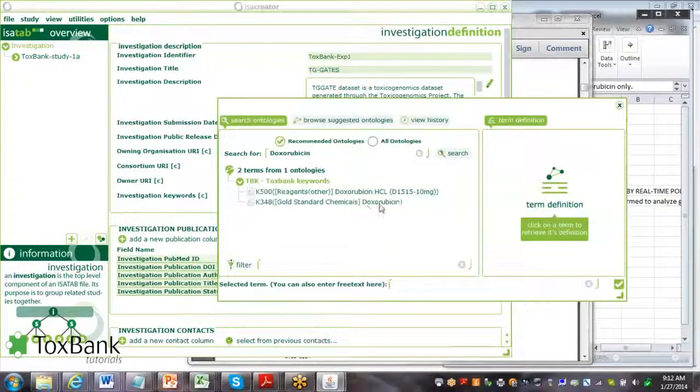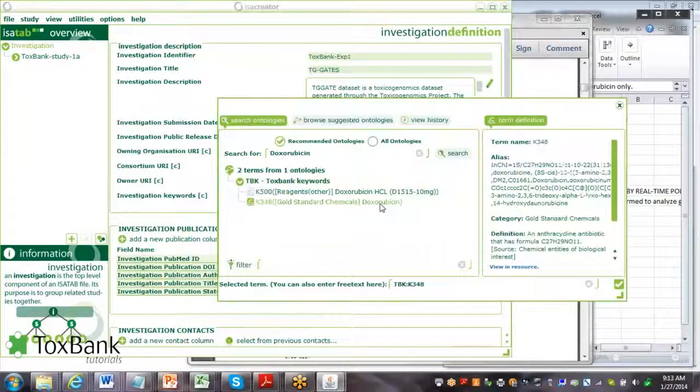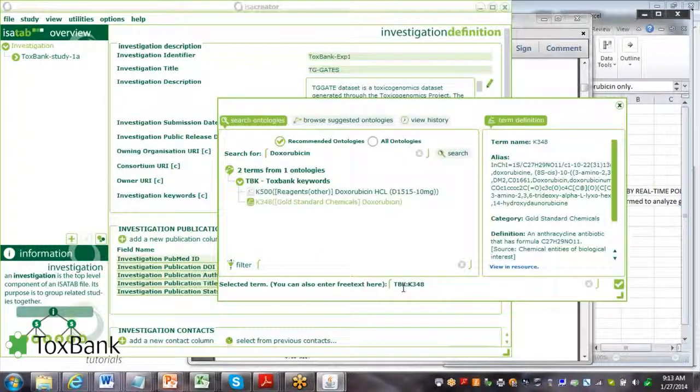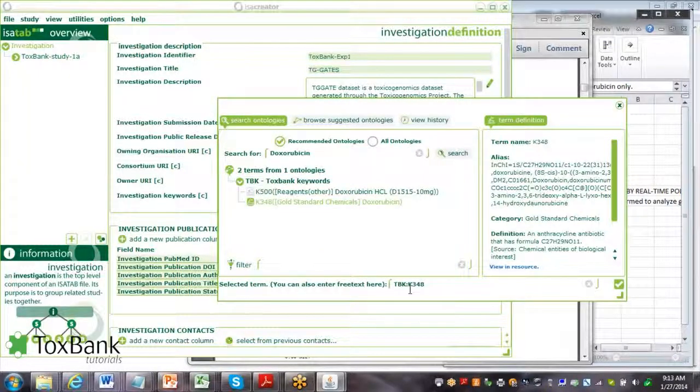Here you can see it's one of the gold standard chemicals. We add it, and it's added. You can see this code here, K348, this is doxorubicin.